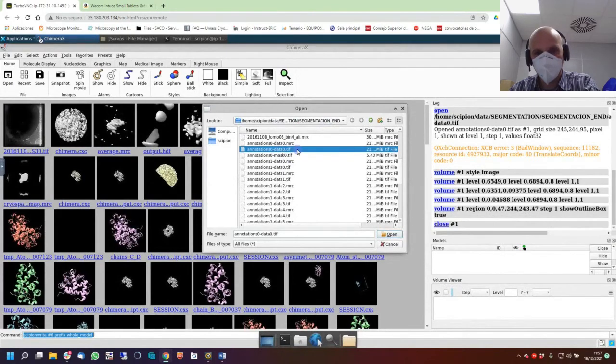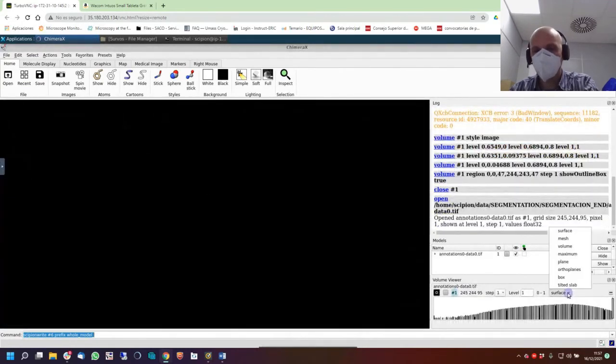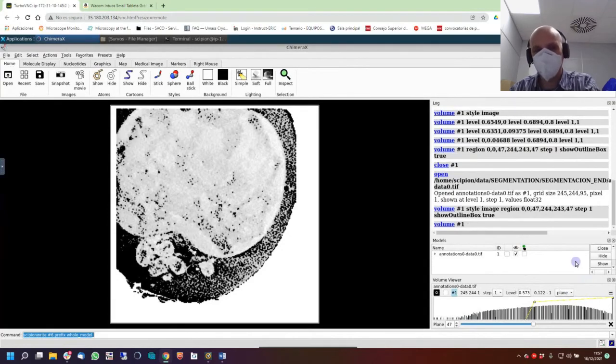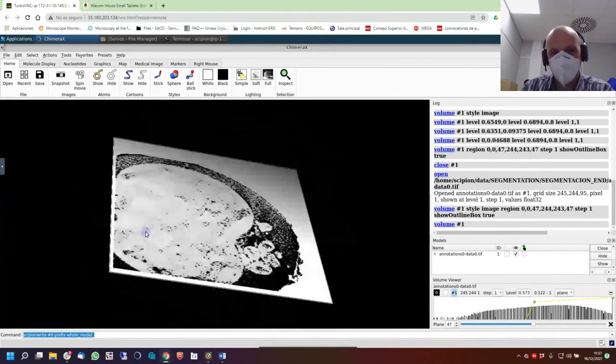Okay, open. There's nothing. No. Let's go for plane. Where do I find plane? Now I see. Thank you. I didn't see where you changed to plane, and therefore I didn't see anything.